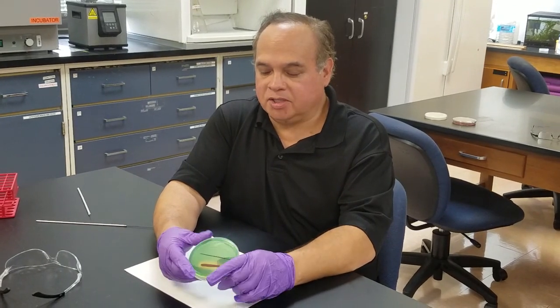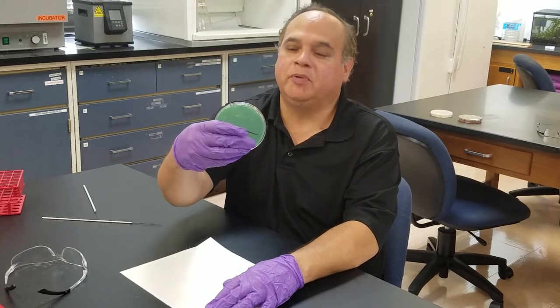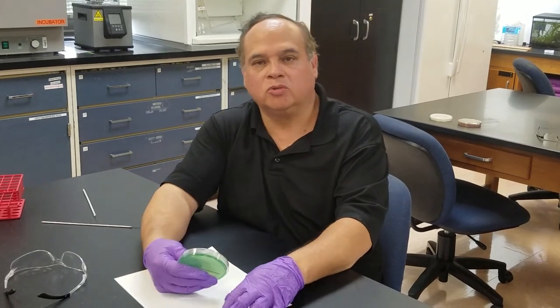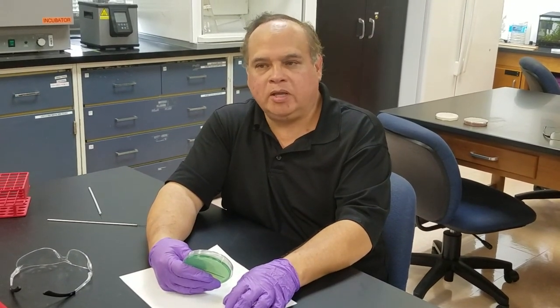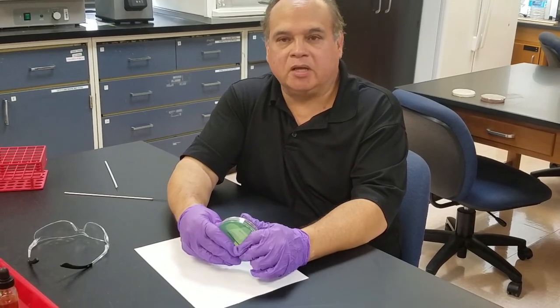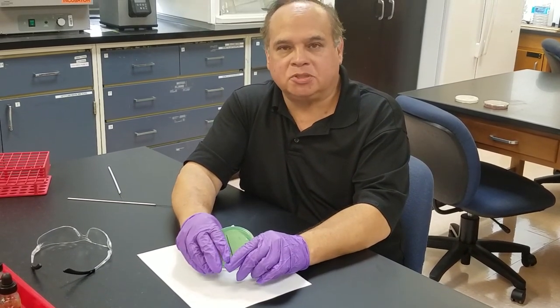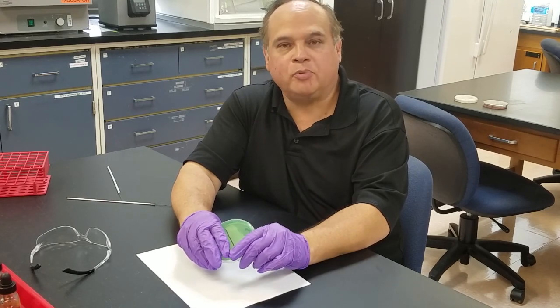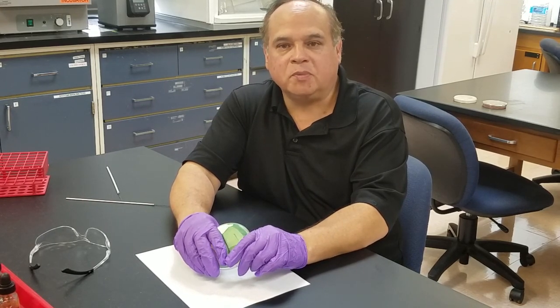What we have here is a plate that appears green, sometimes almost a blue-green or teal color. That is because there's a presence-absence indicator that's been put in here, and that indicator is methyl green.